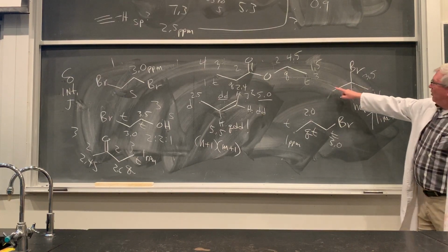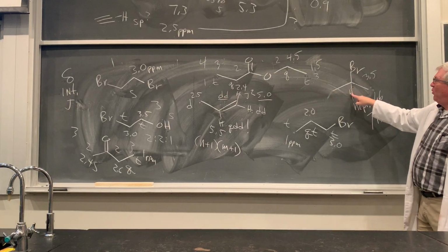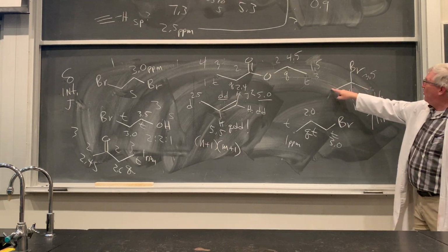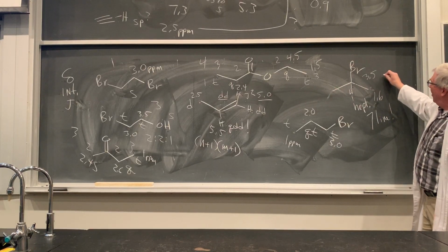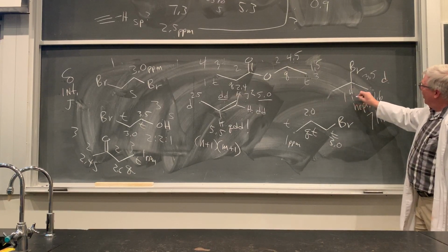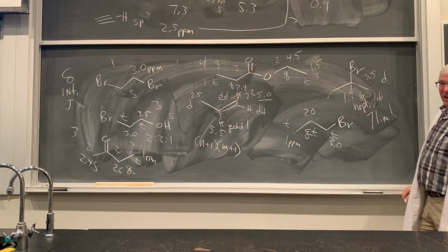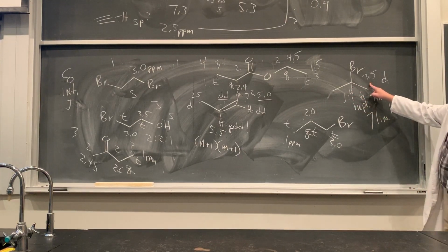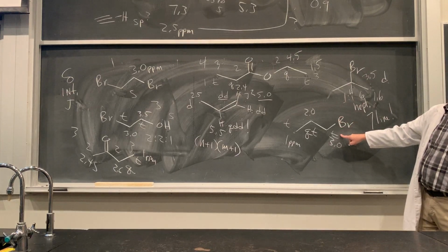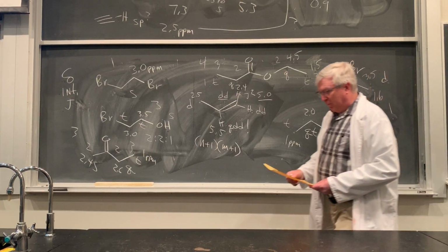What about the methyls here? How many non-equivalent neighbors does it have? Just the one. So these will show up at the same spot, but it'll be what? A big doublet, okay? And the integration will be what? 1 to, what, for the 2 there, to 6, okay? So you can see that molecule is easy to tell apart from that molecule based on the number of sets, the shift in the multiplicity.